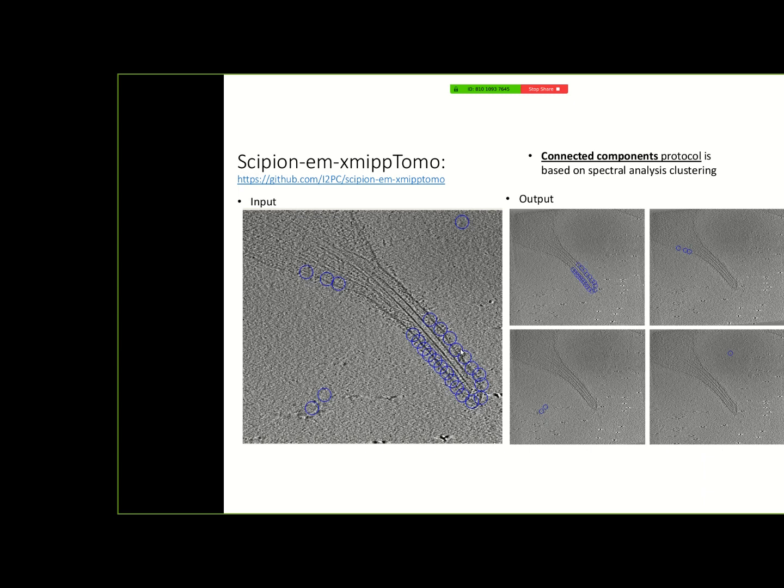Then we have added some other tools. Let's say that you do an automatic template matching on your tomogram, and then the program produces some candidate particles, but you are only interested in the particles that are on membranes. Normally these scattered points outside the main region are mostly false positives. They might also be particles, but then they normally cluster in some way. So this tool clusters the 3D coordinates according to their distance. So it defines from this picking, for instance, 4 regions. In these 4 regions, you see that all these particles are close to each other, and then you may impose some filter on what cluster you want to analyze: the size of the cluster, the maximum distance, minimum distance, things like that.